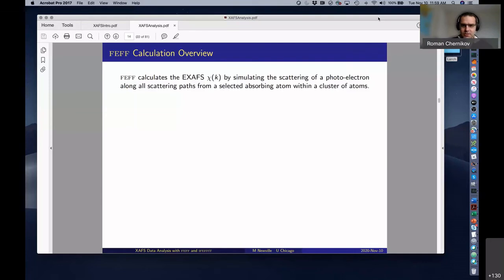There was another question. Is there any threshold to decide the best models according to the residual factor? Is it simply the lowest R, or are there other factors you have to look at? Yeah, if the lowest R factor and the lowest chi-square or reduced chi-square don't agree, then you've got a question.